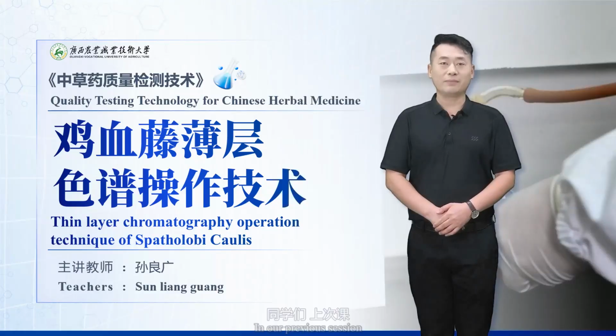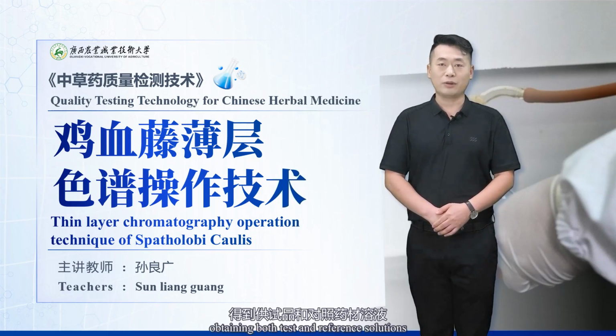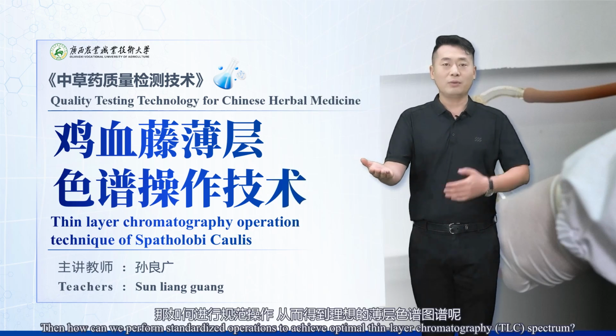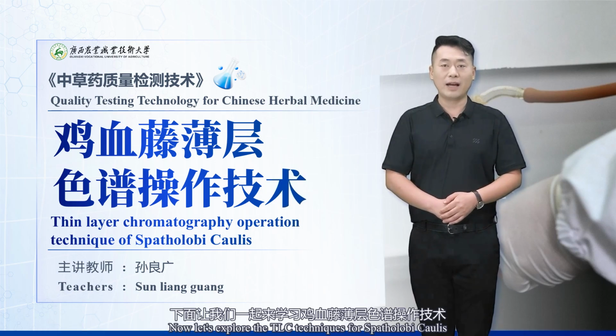In our previous session, we mastered the sample pretreatment of Spatholobi Caulis and its reference material, obtaining both test and reference solutions. Then how can we perform standardized operations to achieve an optimal thin layer chromatography (TLC) spectrum? Now, let's explore the TLC techniques for Spatholobi Caulis.